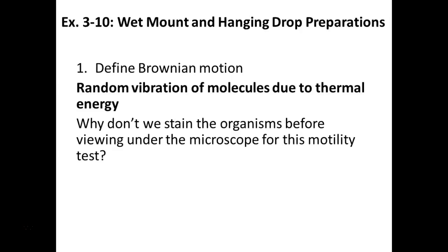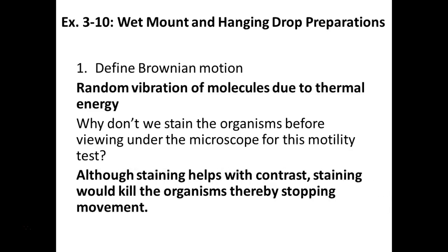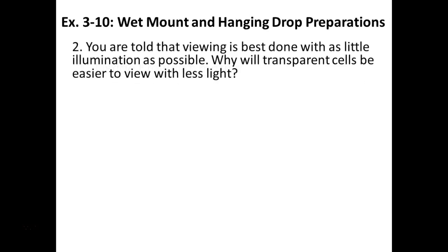So why do we stain organisms before viewing them under the microscope? To help us visualize them, right? To create contrast. But we can't do that here because what would happen? They would die, right? So as I said, we're going to decrease the light to help with visualization.